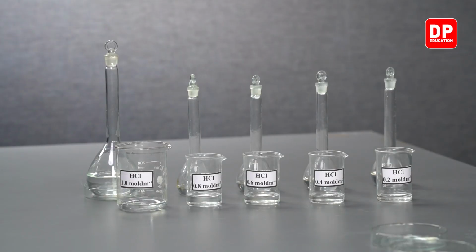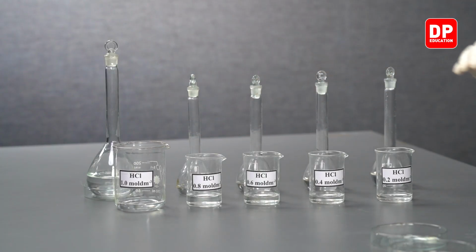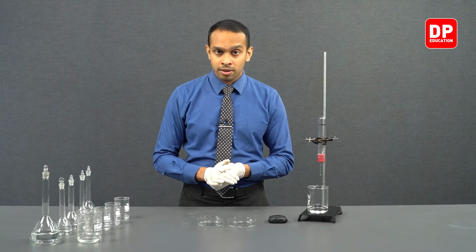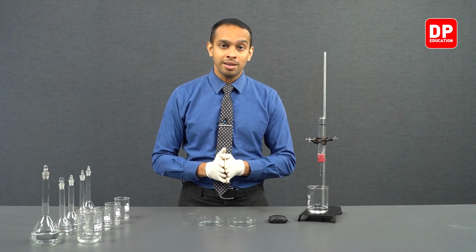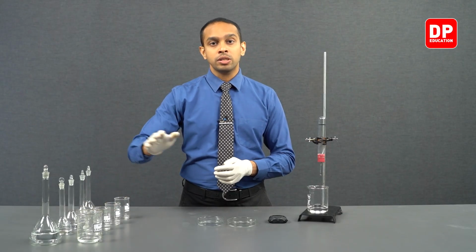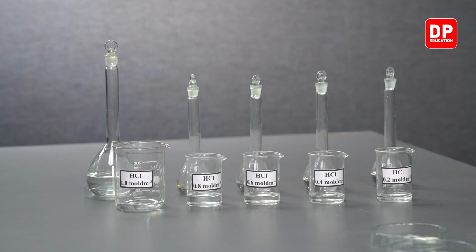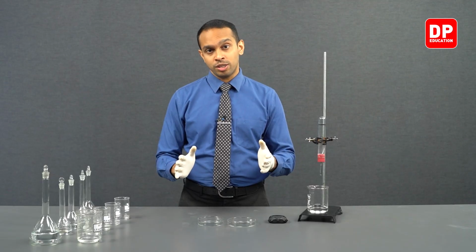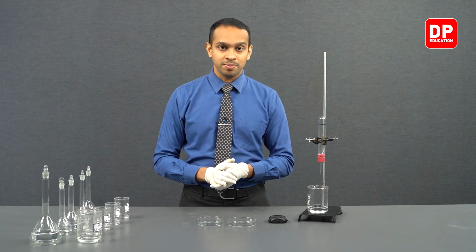And when it comes to 1.0 moles per decimeters cube concentrated HCl, we saw the same amount of hydrogen gas was collected within a very small time period, like 6 seconds or under 6 seconds. We were able to collect the same amount of hydrogen gas in under 6 seconds.